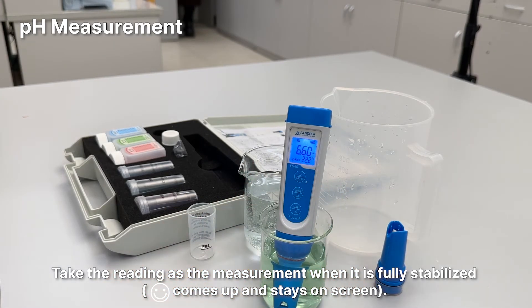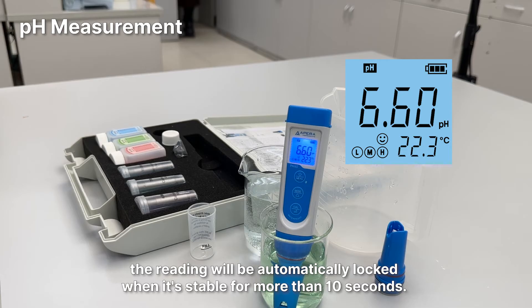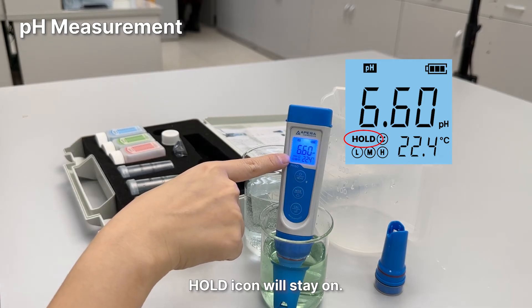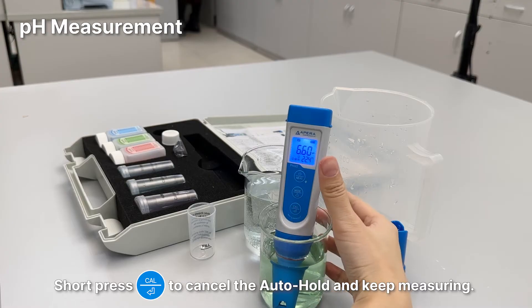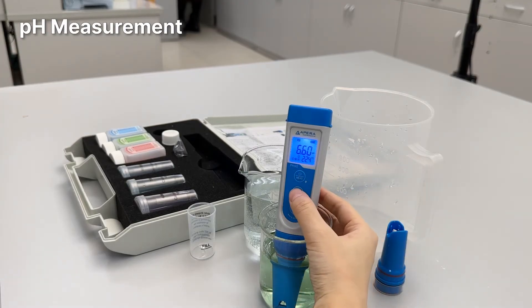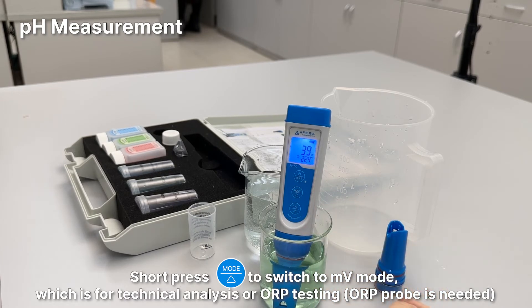Take the reading when it is fully stabilized. If you turn on the auto-hold function, the reading will be automatically locked when stable for more than 10 seconds and the Hold icon will stay on. Short press the CAL button to cancel auto-hold and keep measuring. Short press the Mode button to switch to mV mode, which is for ORP testing or technical analysis.